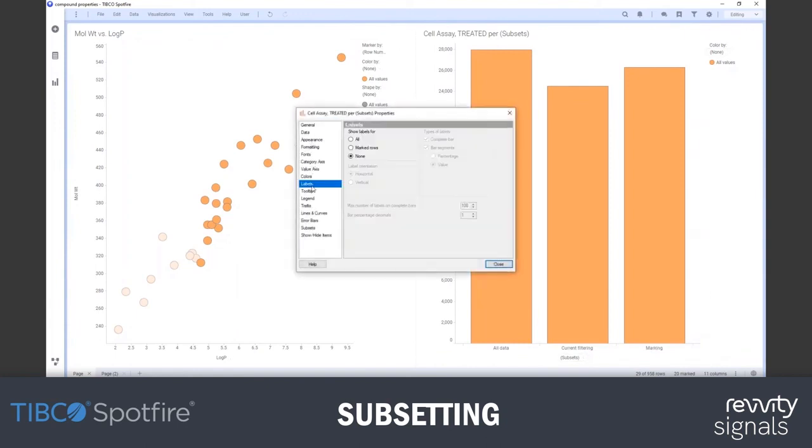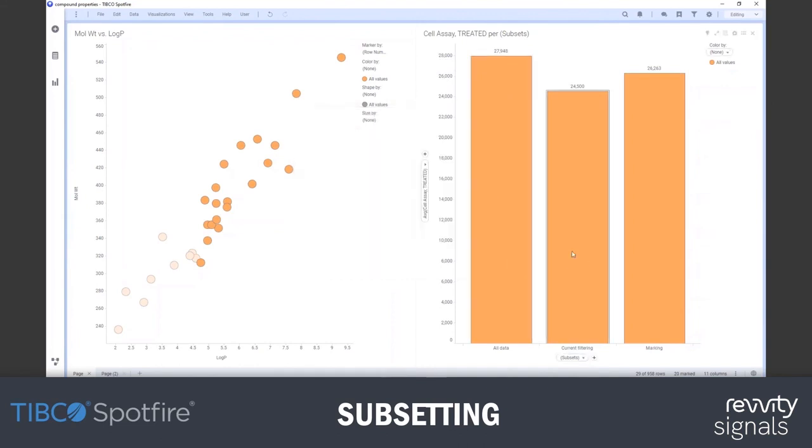So now I'm looking at the average for everything, the average for the current filtered group, which is these 29 rows over here, and then the average for my markings. So it's a nice way in a single visual to look at different slices of the same data set and engage with it through the filtering, the marking and the drill down. So something to maybe experiment with there.